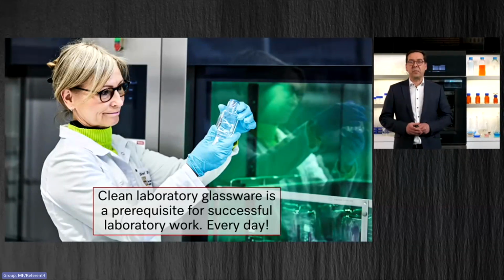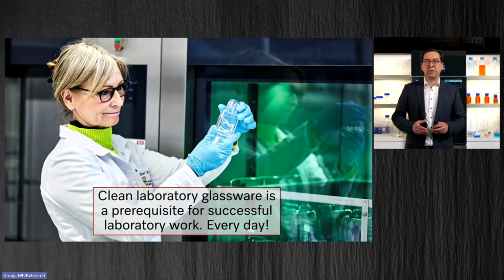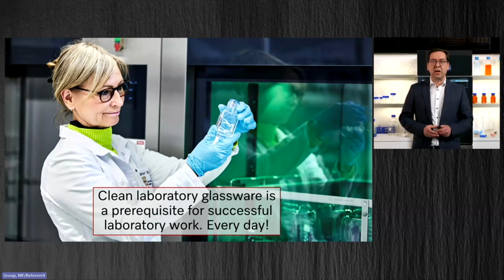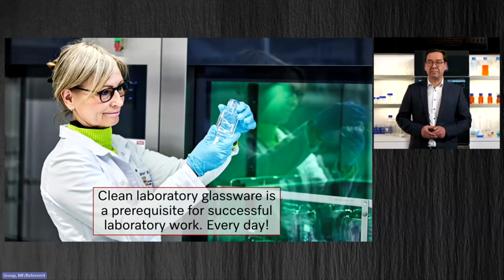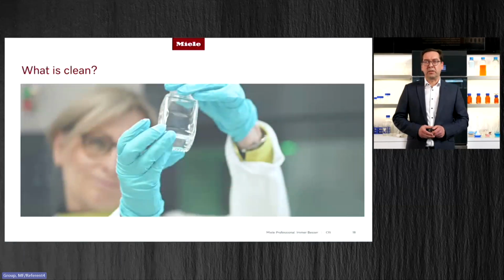Cleaning laboratory glassware is a daily duty. It's a very important task because all labs all over the world need analytically cleaned lab glassware to be able to carry out the next analysis. So it's really important that we take care of what we are doing to achieve the right results. But that automatically also leads to the question, what is clean?